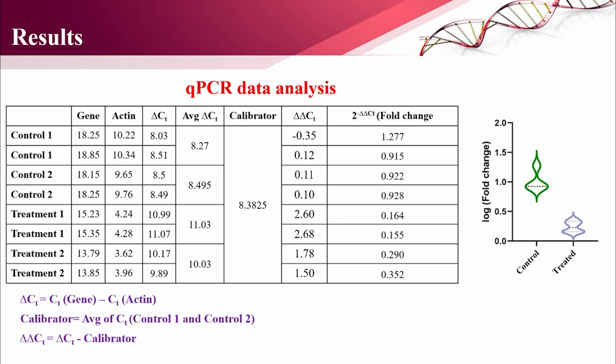This data is just example data, but later on I will do the qPCR practically, and then I will show you the real data which we get from the qPCR results. Then we will also use that data, find the fold change, and make the graphs. So I hope you will learn from these things, and if there is any question you can ask me in the comment section.